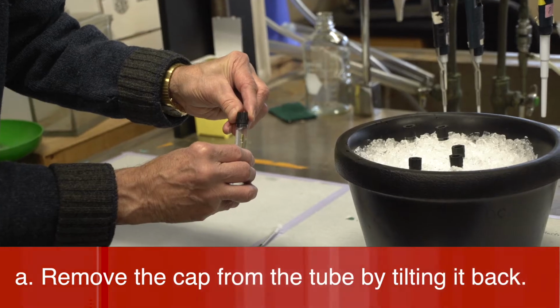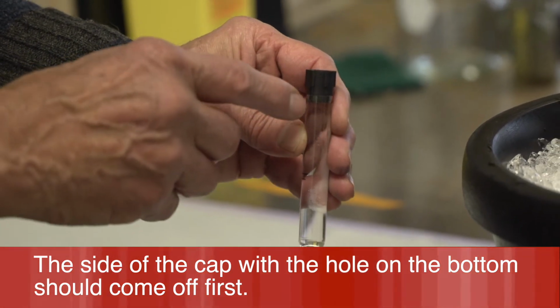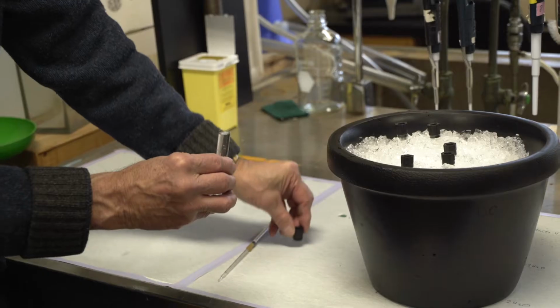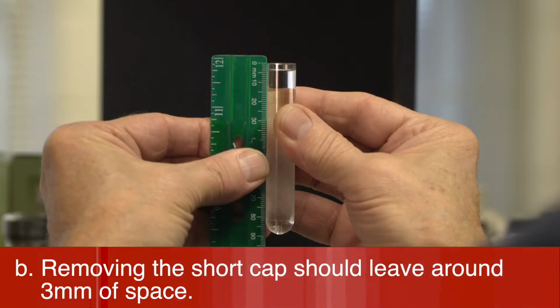Remove the cap from the tube by tilting it back. The side of the cap with the hole on the bottom should come off first and is indicated by some extra material on the cap. Removing the short cap should leave around 3 millimeters of space.